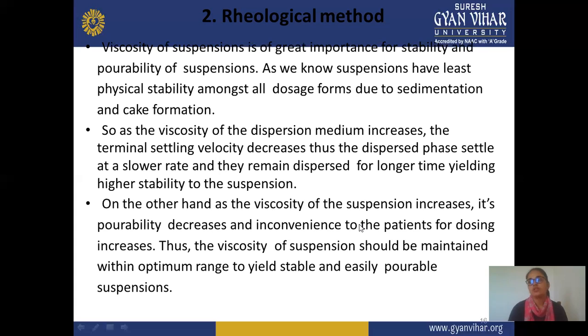If you do not check this rheological property of the suspension properly, there may be chances that you take the reading of the sedimented solution. And when you take the sedimented solution, the rheology of your formulation may change, because your formulation is not in a proper uniform condition, or it may show some viscosity problem, because some particles get sedimented and some remain suspended in your solution.